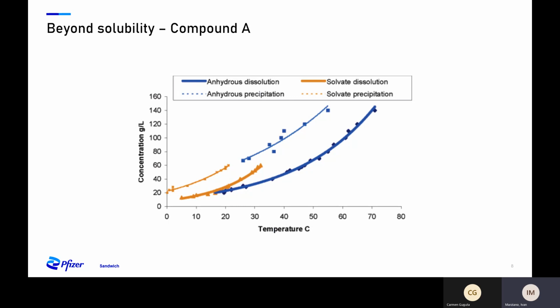What we observed is that we were able to build a set of 2 curves for the first cycle. However, for the second and third cycle, particularly at the lower concentrations and the lower temperatures, we did define a second set of curves, which is also shown in here. What subsequently transpired, and we didn't know this at the time, is that the particular compound likes to form a solvate in this particular solvent system, and kinetically the solvate in certain conditions forms more readily than the desolvated form.